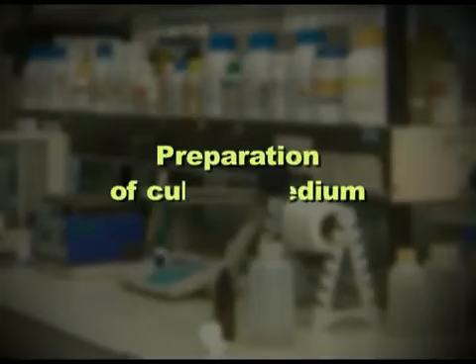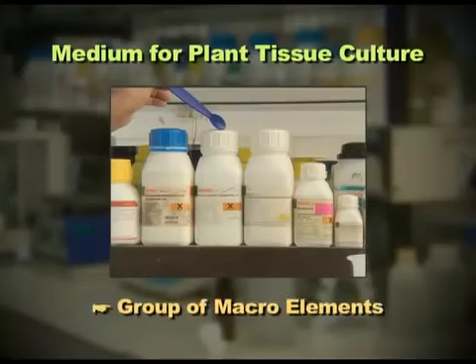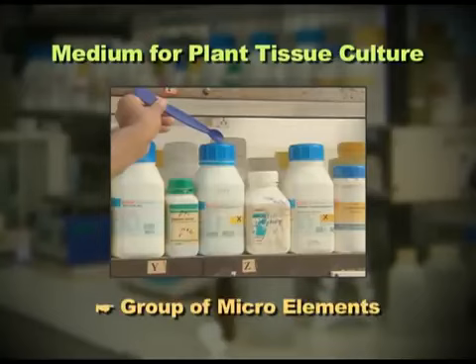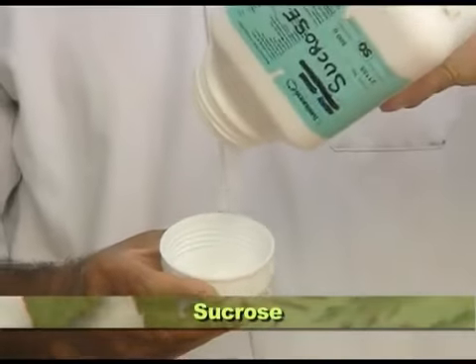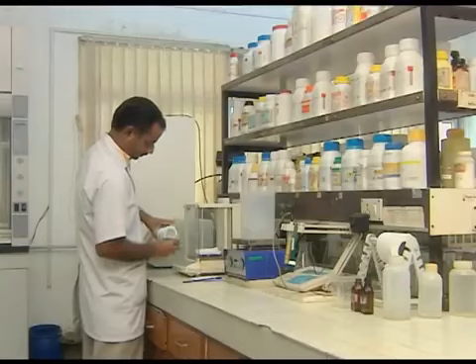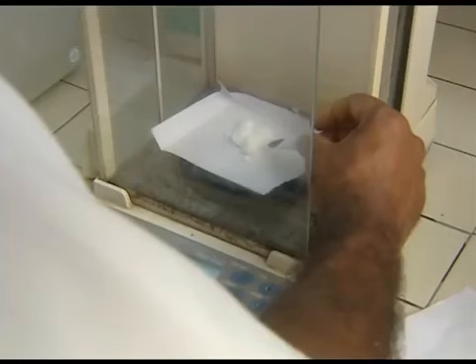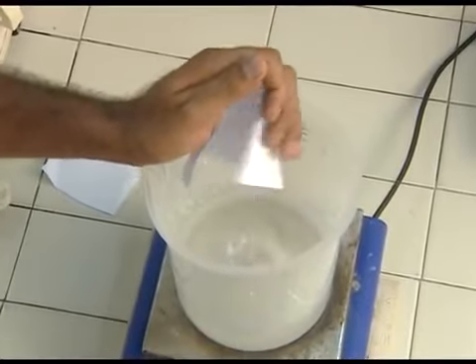The next important process is preparation of a media which is to be used in the process of micropropagation. A medium for plant tissue culture will comprise a group of macroelements, a group of microelements, vitamins, amino acids, and most importantly sucrose, which serves as a source of carbon and which is the carbohydrate for the plant. The amounts of salts to be taken have to be precisely weighed as per the reported formulations, and these have to be dissolved in deionized water.